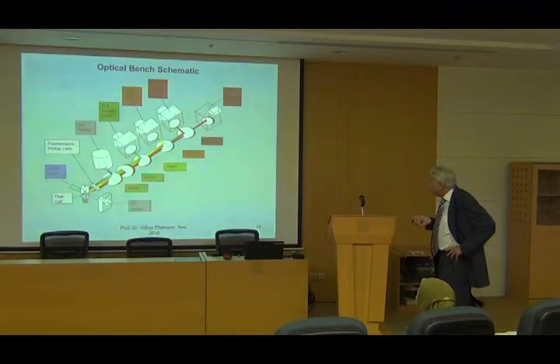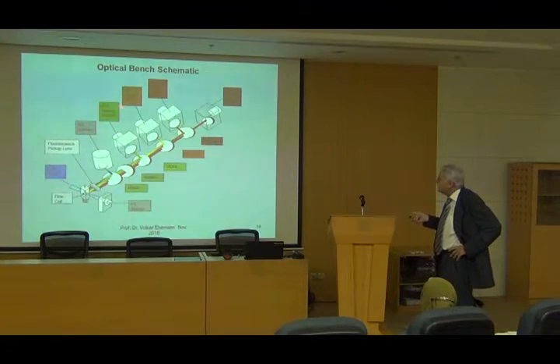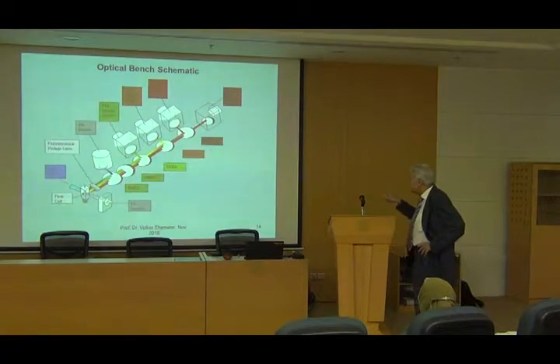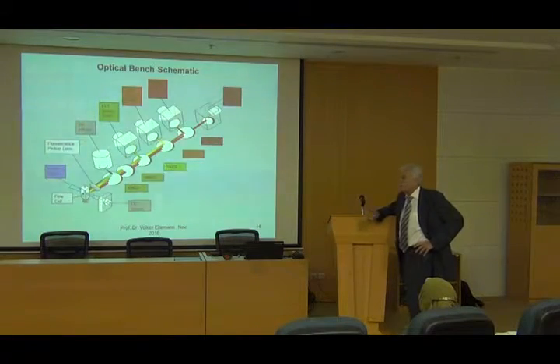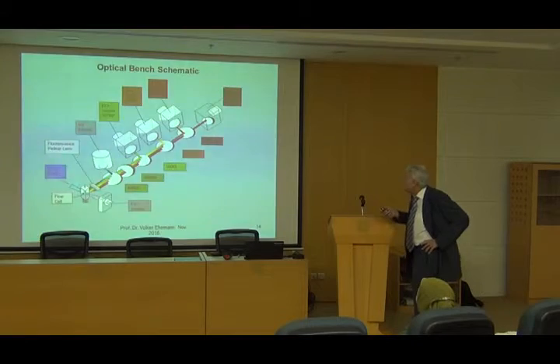And you see filters with different wavelengths. For example, the FL1 sensor is a bandpass filter, and with this photomultiplier you can detect, for example, FITC colored cells.